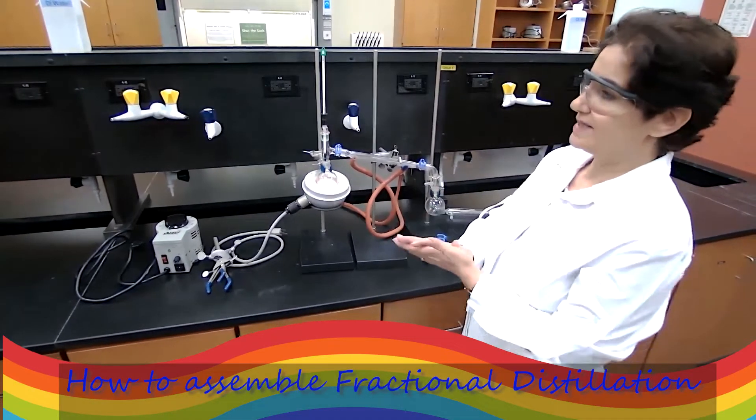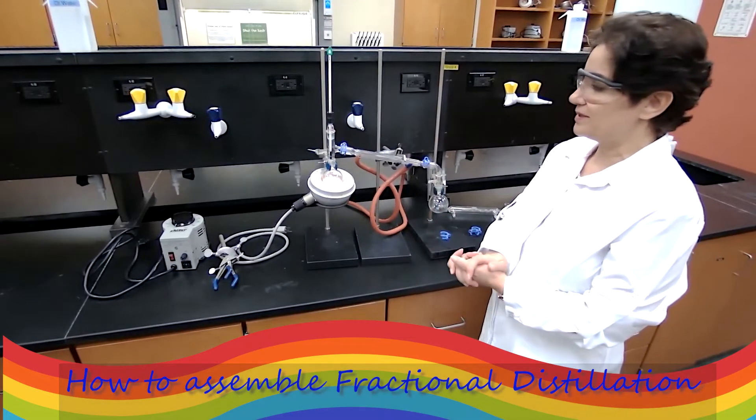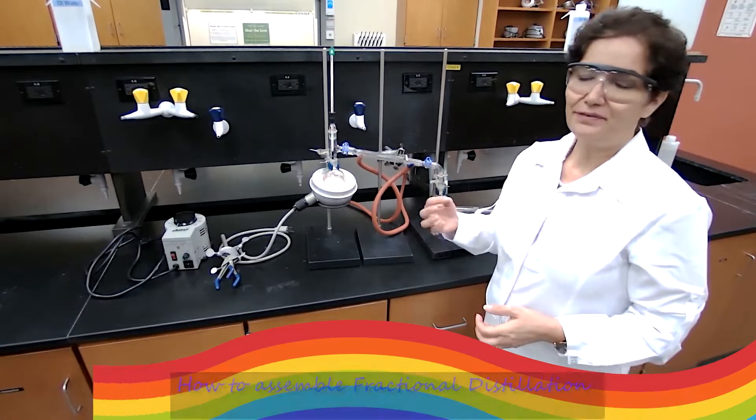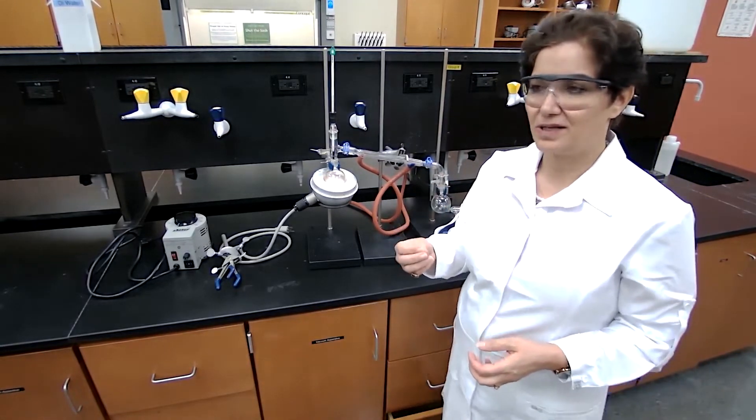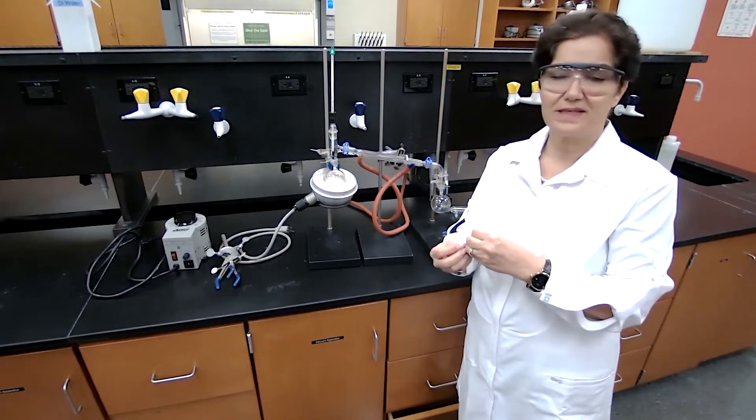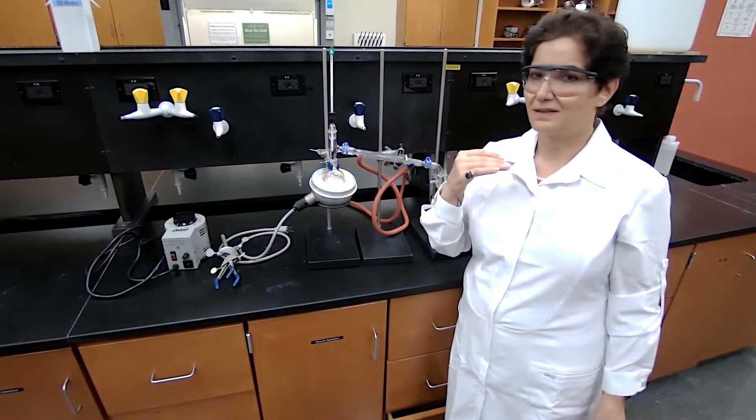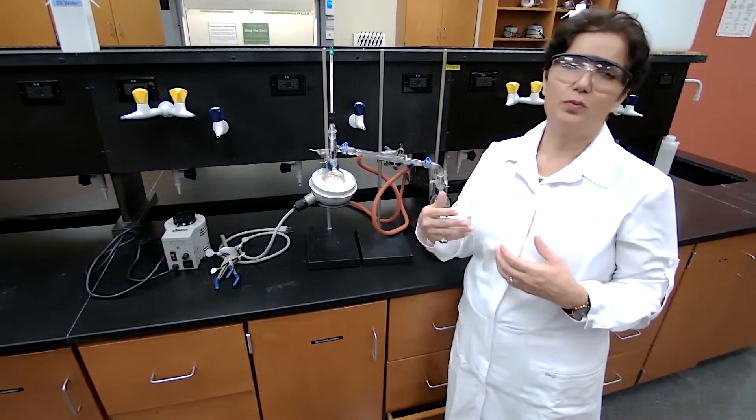We are done with the assembly of simple distillation. Now we're going to talk about fractional distillation. The difference between fractional distillation and simple distillation: simple distillation can be used for separation of two liquids with significantly different boiling points.